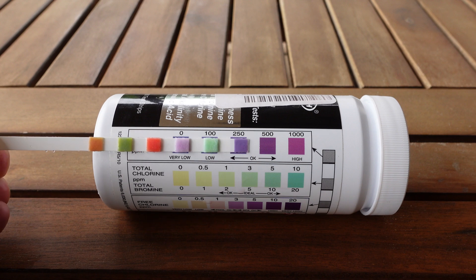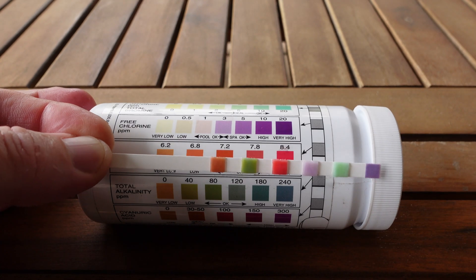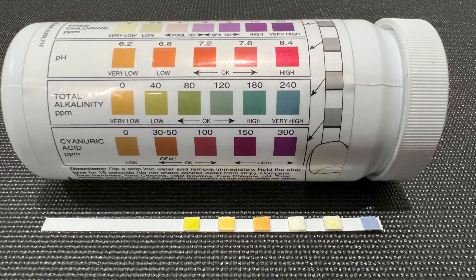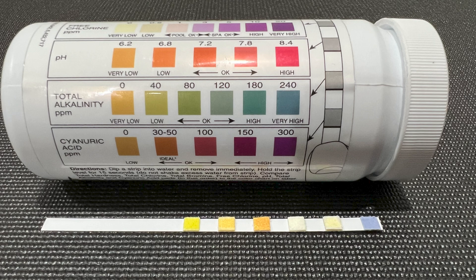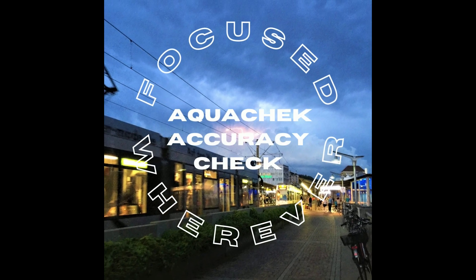Test strips are more subjective based on interpretation of the colors, or where a test area falls if between two colors. However, I find that for each test area, the difference in color between the different levels provided on the packaging is sufficient to get a pretty accurate read on the quantity it's representing. Join me now as we check the accuracy of these pool test strips, and if you like these kinds of videos, consider subscribing to find your way back for more.